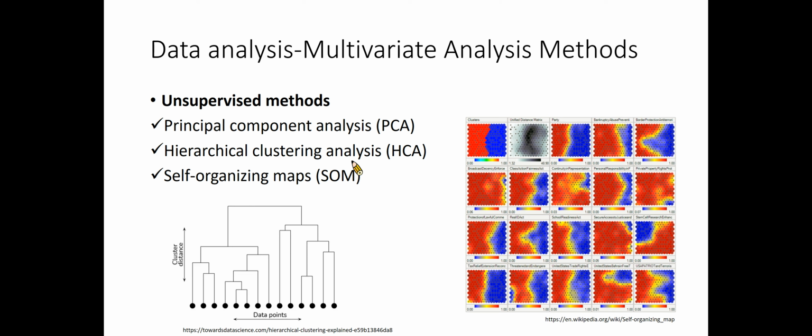After applying the PCA method, a set of loading vectors and score vectors are obtained. The loading vectors represent the principal components, with each vector coefficient corresponding to the individual contribution of each variable to the principal component. The score vectors represent the projection of each sample onto a new orthogonal basis. Plotting these sample scores over the first principal components is a convenient way of summarizing the global dataset, since normally these first principal components capture most of the variability in the dataset.